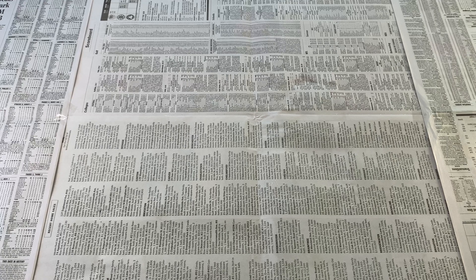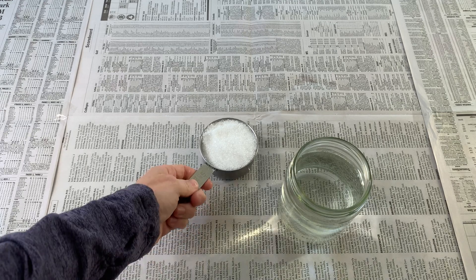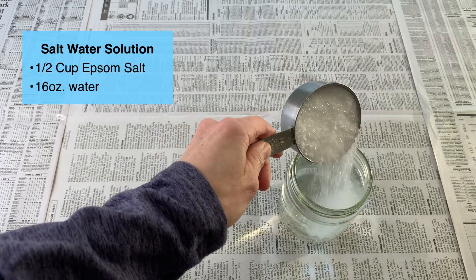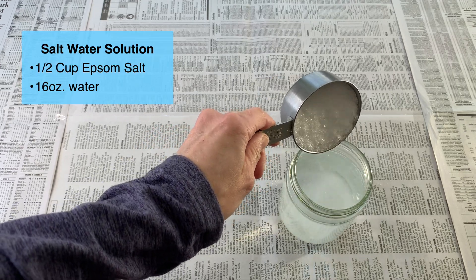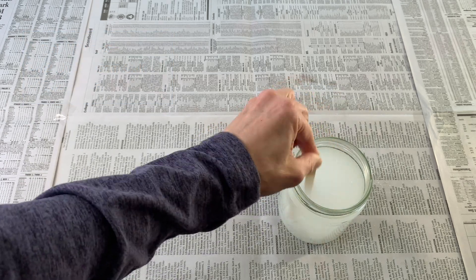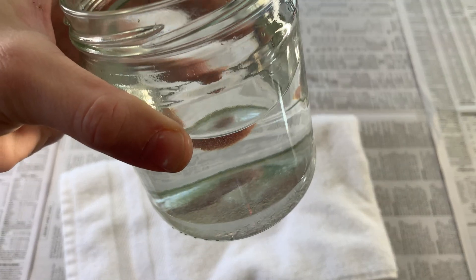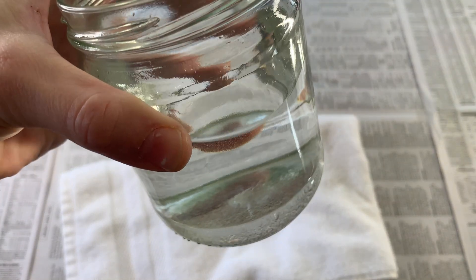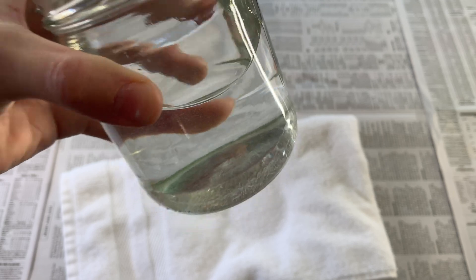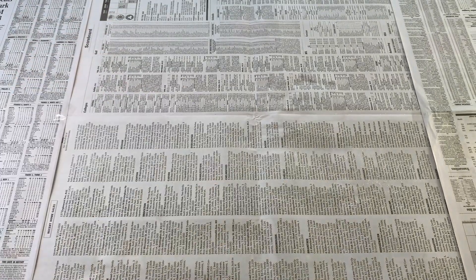With your supplies gathered, your first step is to make a saltwater solution with your Epsom salt. To make the solution, mix half a cup of Epsom salt in 16 ounces of warm tap water. After mixing, let the solution sit overnight. The next day, you want to look for some grains of salt at the bottom of the container. If you see this, you know your water is fully saturated and you have enough salt. If you don't see grains of salt, add some more Epsom salt and repeat the mixing and soaking process.